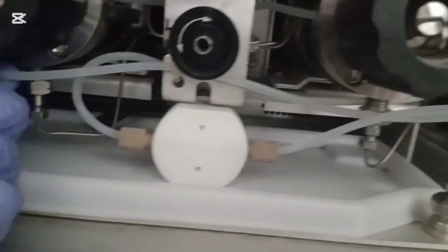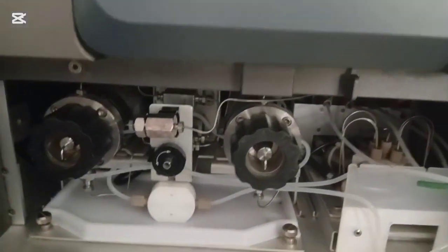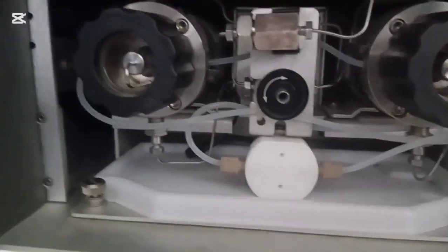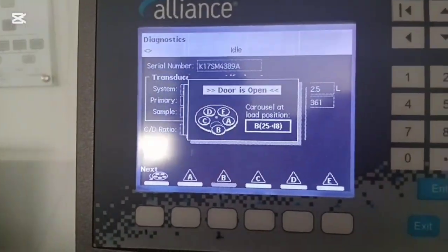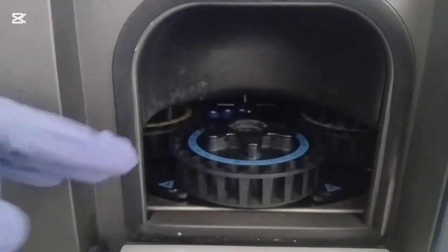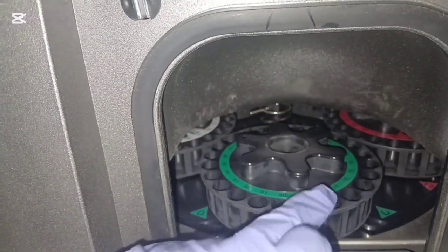Step 2. Prime Seal Wash. Next, click on Prime Seal Wash and press Start. You can stop it manually, but it's better to let it finish automatically. This process washes the seals properly and gives you better results. Seal washing usually takes 20 to 25 minutes. It removes any buffer or salt deposits that form in the lines during continuous HPLC operation. These salts build up around the junction areas and can block the lines, causing plunger overpressure errors. That's why daily seal washing is essential.